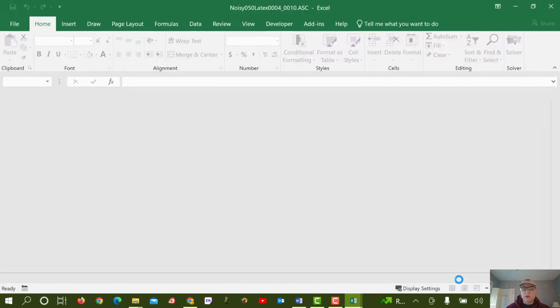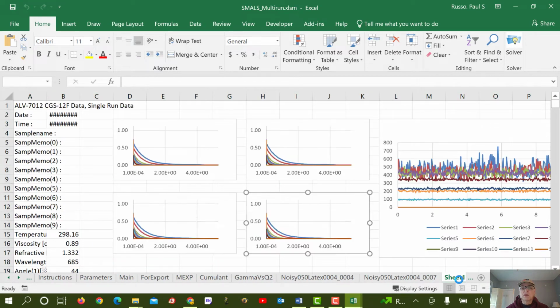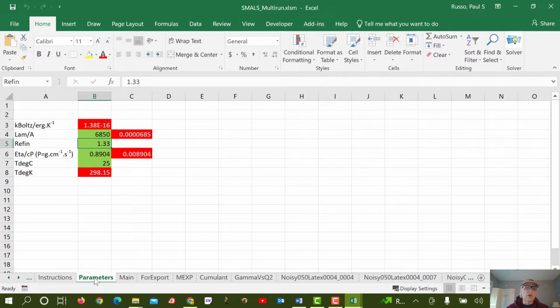So we already inspected them, so there's no need to inspect them further at this point. Okay, so what we'll do is we go back to main. And actually now is a good idea to, before we do that, let's check that we have our parameters right. Yes. Okay, this is important to have your parameters right. Really should have done that at the beginning.